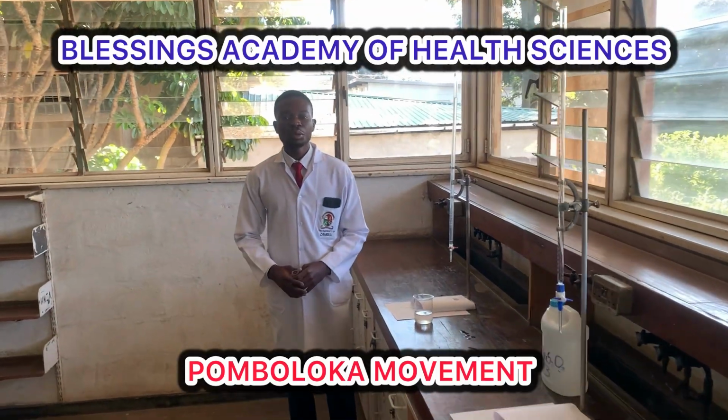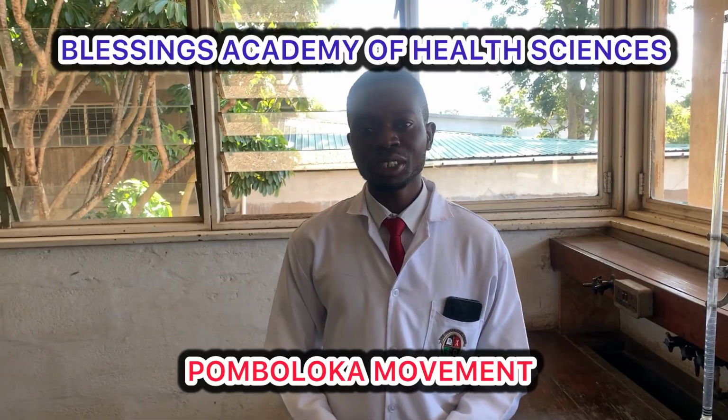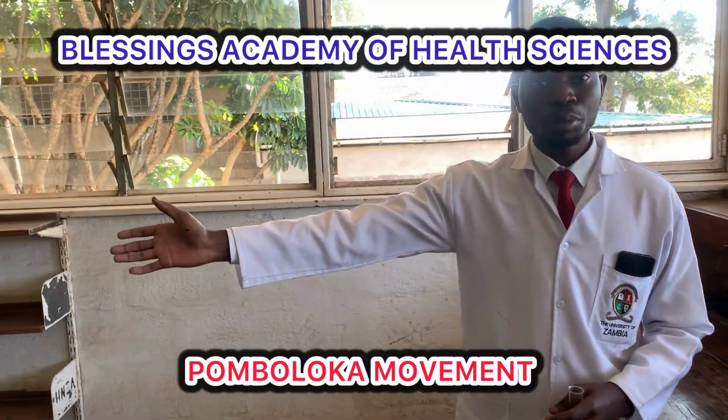All right, now we want to dive into the lab session and introduce the technicalities of procedure. So the first thing we're going to do is with the first sample, which is sample A.